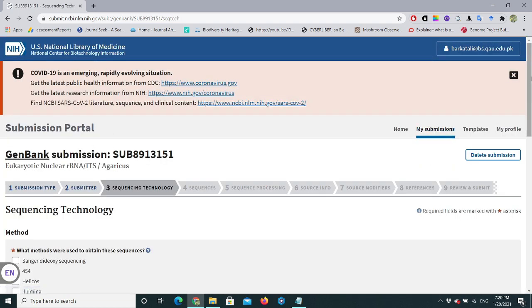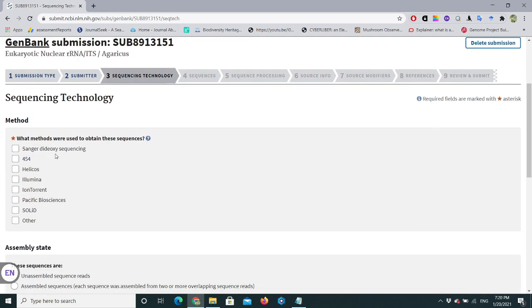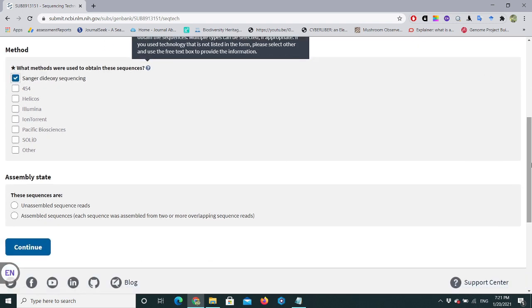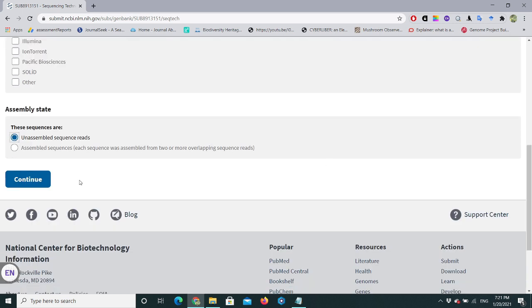Now we have the third step — Sequencing Technology. I sequenced this fungus using Sanger sequencing, so I'll select that option. Other technologies like Illumina and Ion Torrent are also listed. For Assembly State, my sequence is unassembled — I just sequenced a small section of my genome — so I'll select 'Unassembled sequence reads' and click Continue.